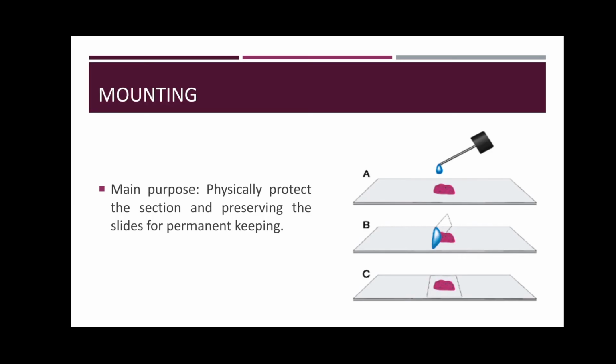The most common mounting media used in the histopath lab in CDUH is what we call Eukitt. This is the most common mounting media used in the laboratory for CDUH.